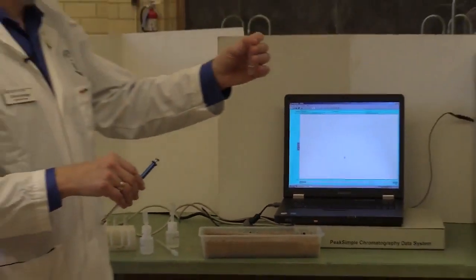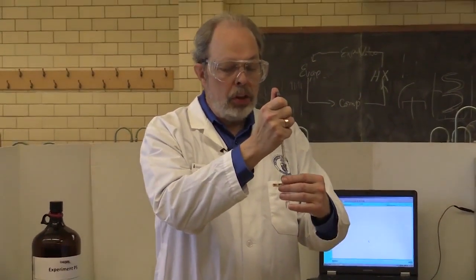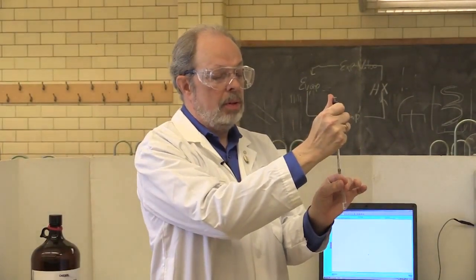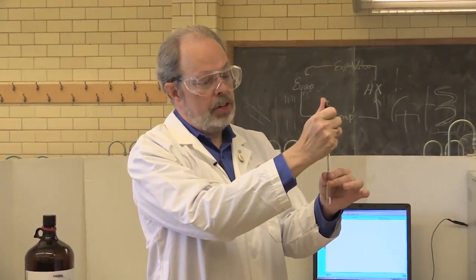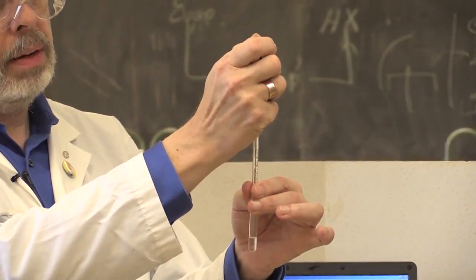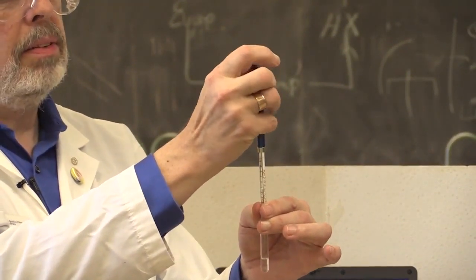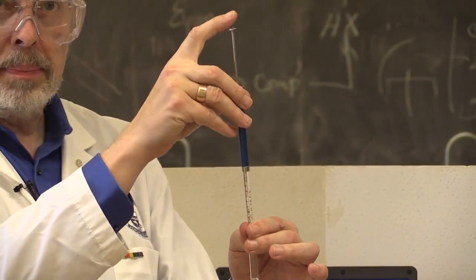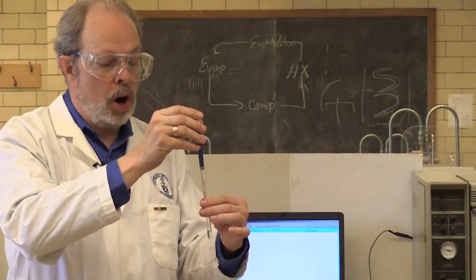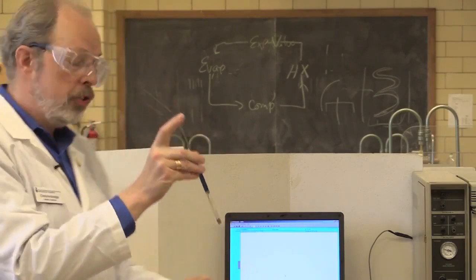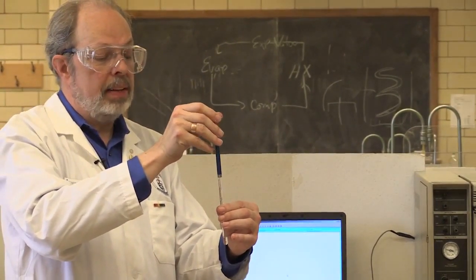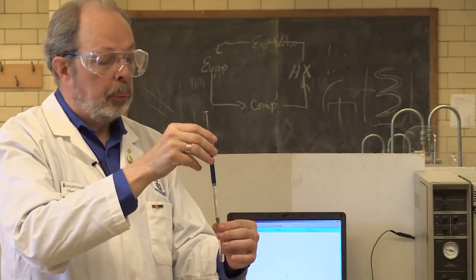And then, I'll take another mixture. This has actually got toluene in it so that you'll see three peaks. And there are two phases here and I hold this in my hand like this between my thumb and two fingers. And when I put the syringe in, I try and hold the barrel of the syringe, place the tip of the syringe needle in the middle of one of the phases and then withdraw a full amount. That's 10 microliters. Then shoot that out onto a Kleenex. We'll do this two or three times to wash the contents of the syringe so that we assure that the contents is exactly the phase we're investigating and that it's not cross-contaminated from a previous sample.